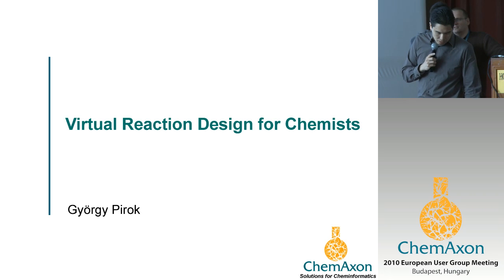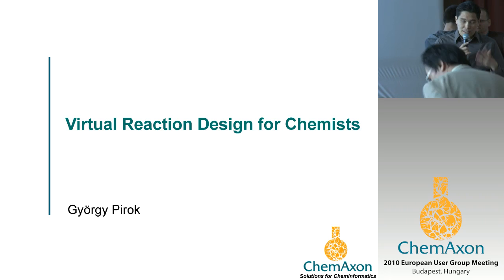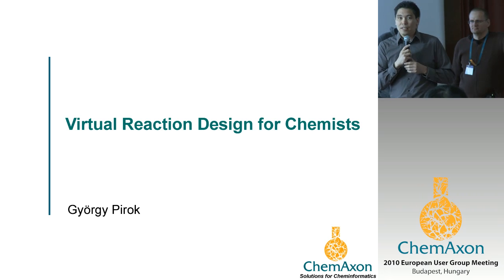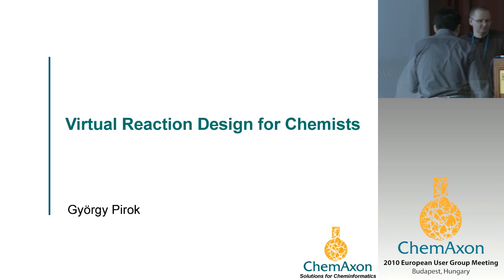His presentation is going to be on virtual reaction design, basically how to get your pile of chemicals and produce a list of the synthetically feasible products. So, without any further ado, György.